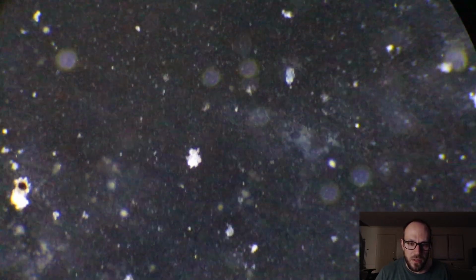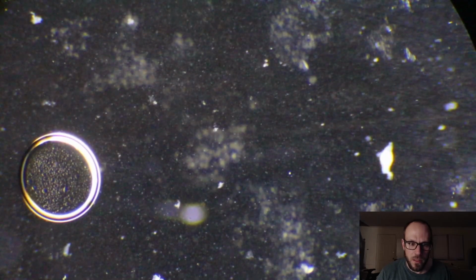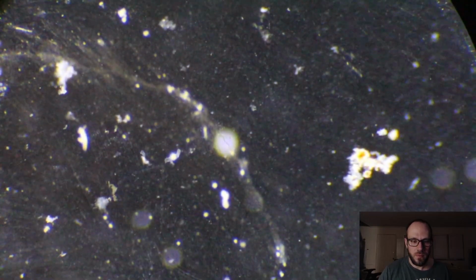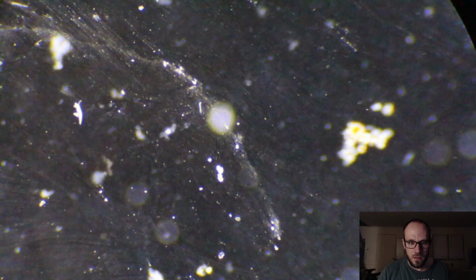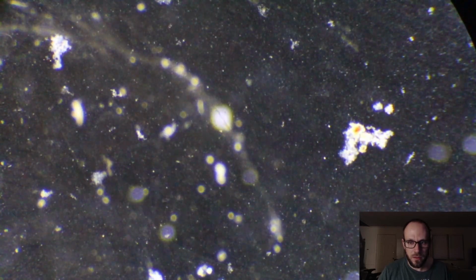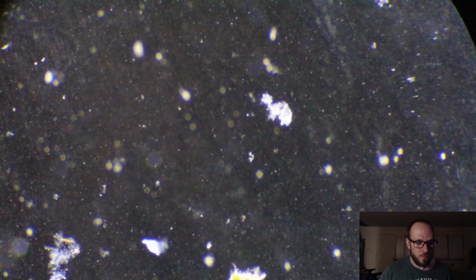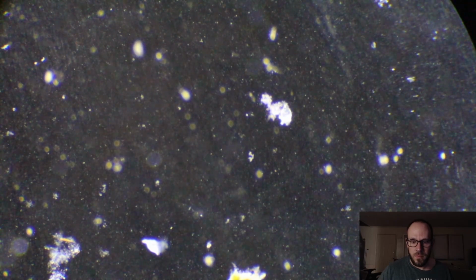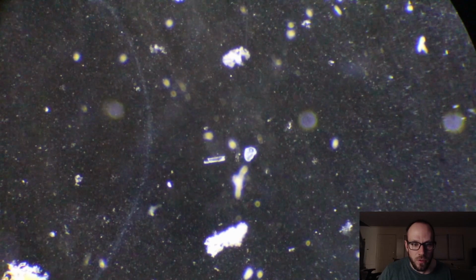It's interesting too that the rotifer didn't explode, but it's not a single-celled organism, so I guess it wouldn't. Anything here? Not really. And yeah, this is going to make some really quality content here.